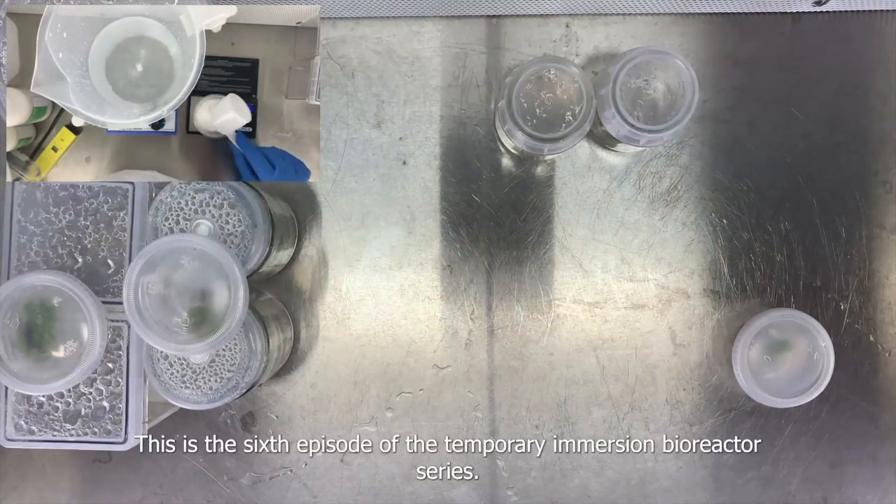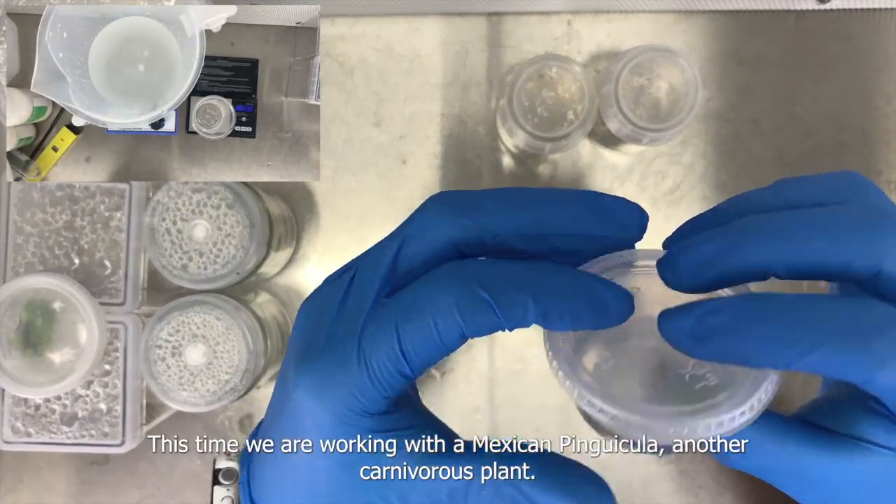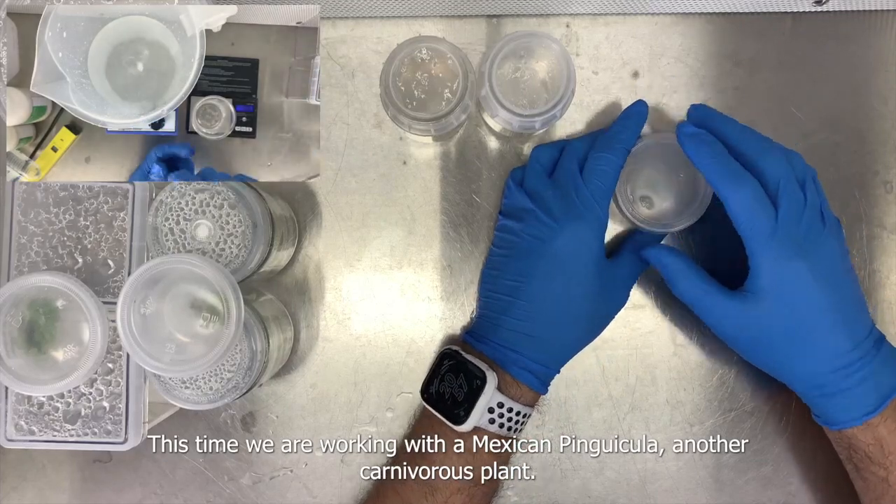This is the sixth episode of the temporary immersion bioreactor series. This time we are working with a Mexican Pinguicula, another carnivorous plant.